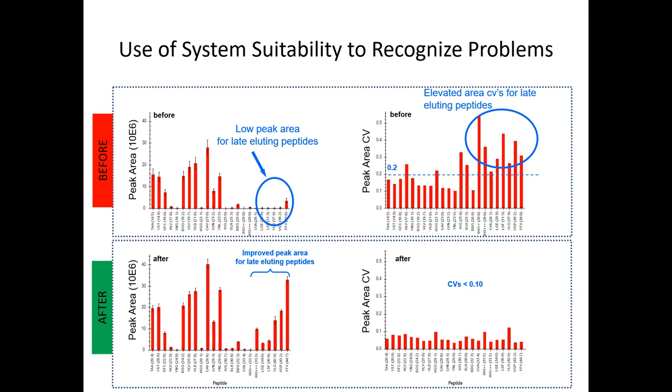So we went to the site and said, hey, something may be wrong with your pump. Can you just check it? They were using an Eksigent pump at the time where you can do flow calibrations, and it takes a long time, and you have to do it for A and then for B, and by a long time I mean like many tens of minutes. It's not fun.